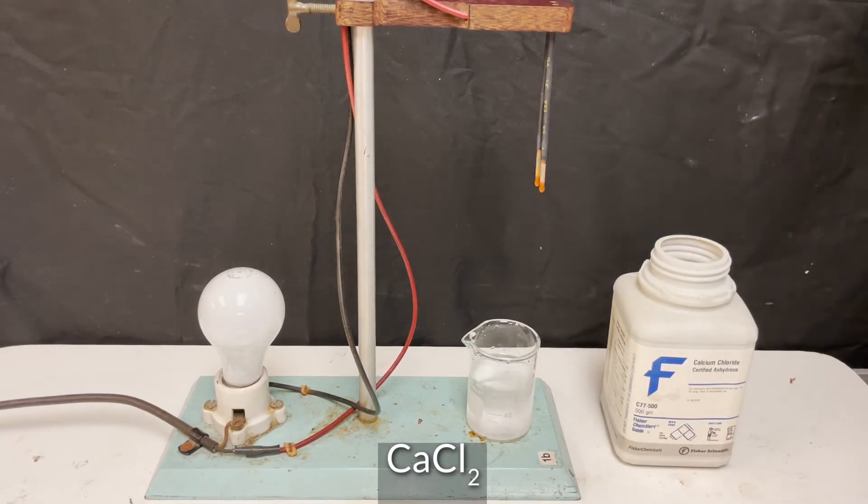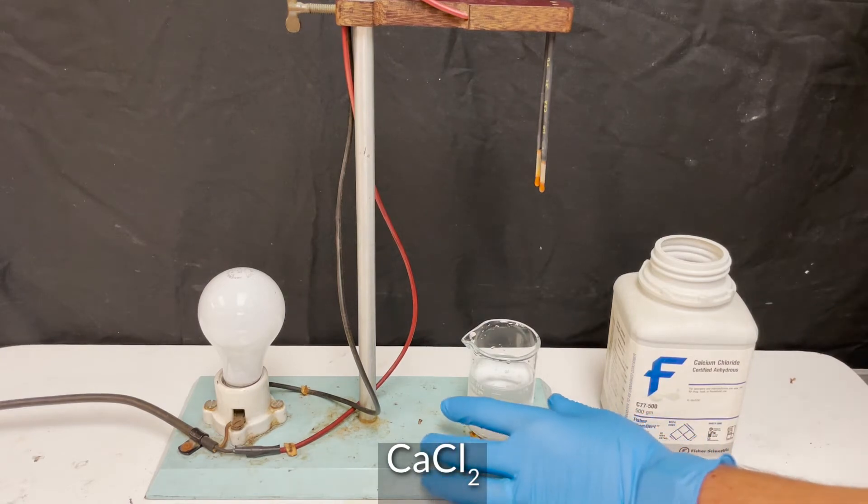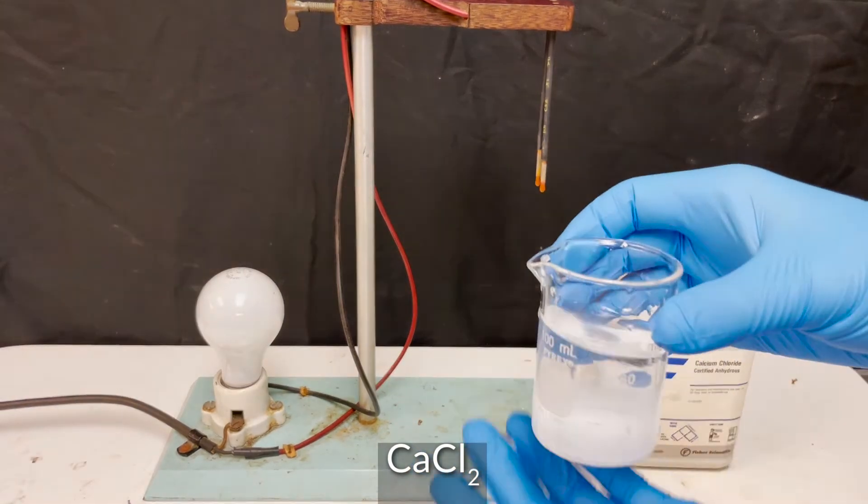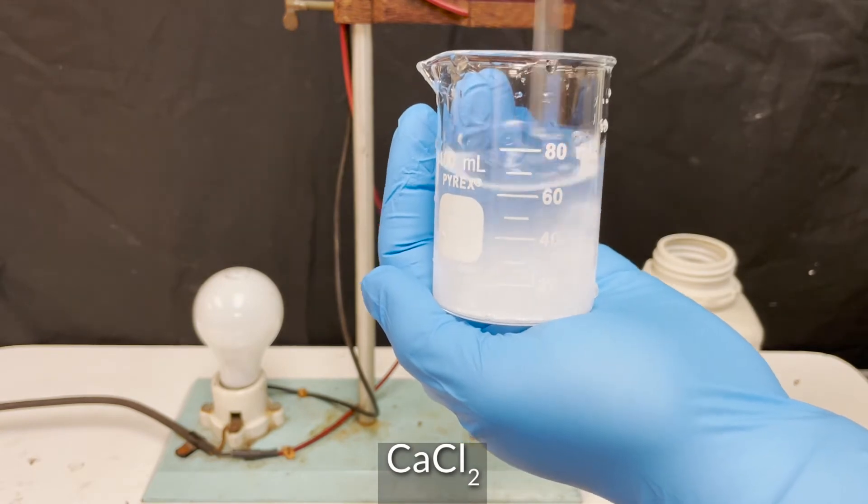Here I'm testing calcium chloride. Solubility rules predict that this should be soluble, and because it's ionic, we can predict that it should conduct electricity.